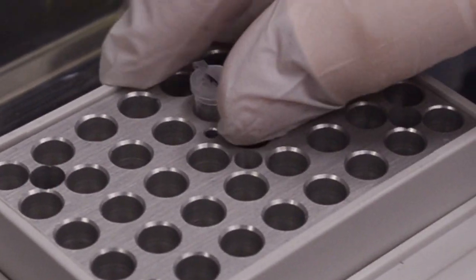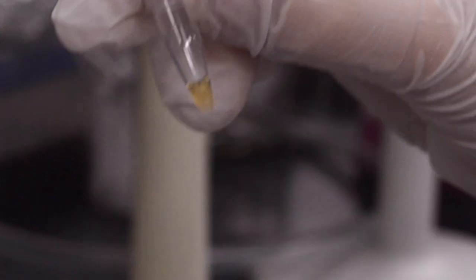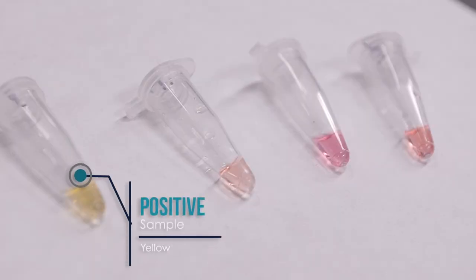Remove the sample from the heat block and observe the color. A yellow sample shows a positive result, while orange and pink show negative.